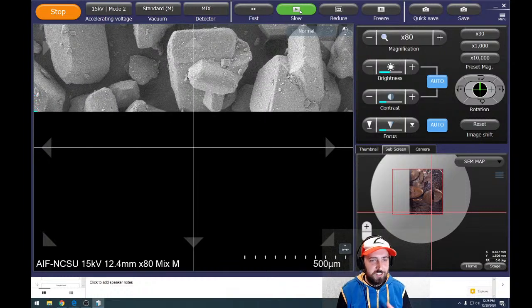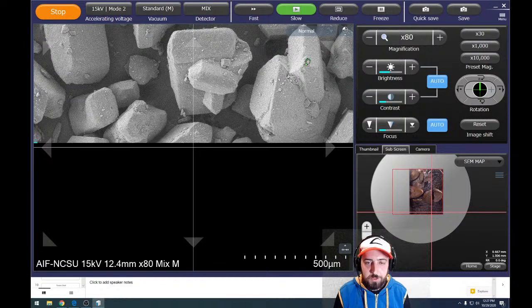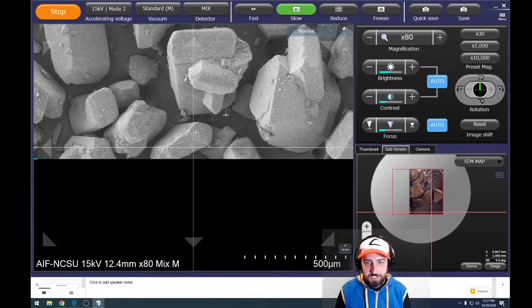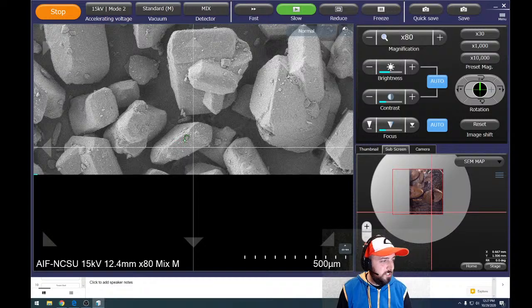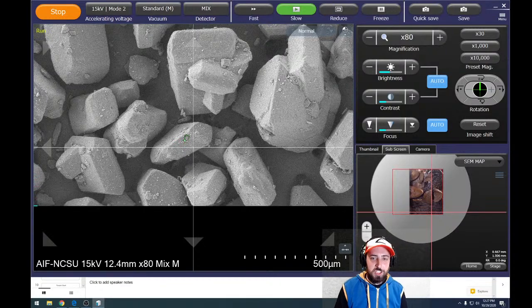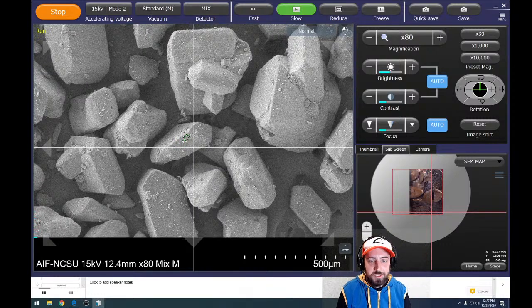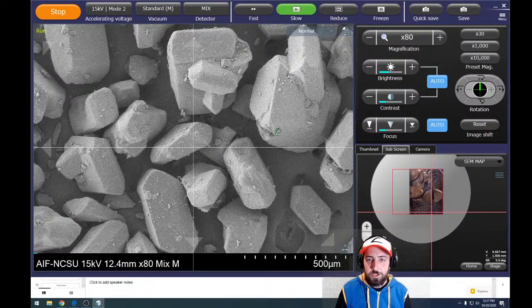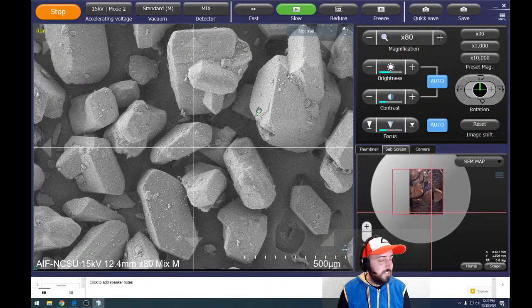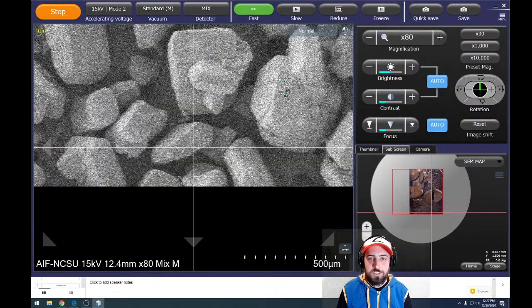To me, it's a little bit bigger, so it's probably a slightly higher magnification, and we have a lot more sugar crystals here. This probably looks familiar if you were with Dr. Holly in the What's Cooking episode. It's just crazy how these shapes look, even under an SEM. They have these very sharp angular features, and they look like crystals. And we see a lot of crystals in nanotechnology.